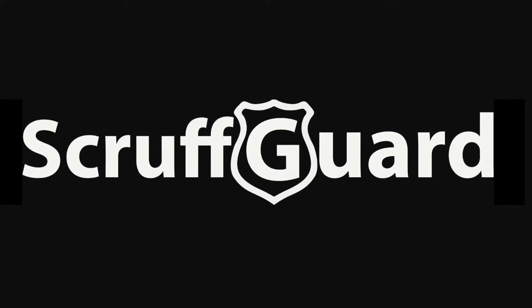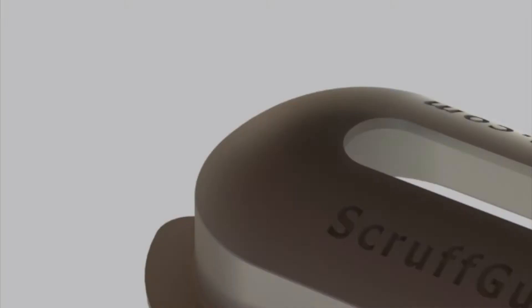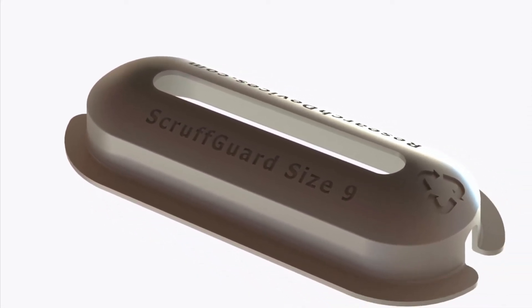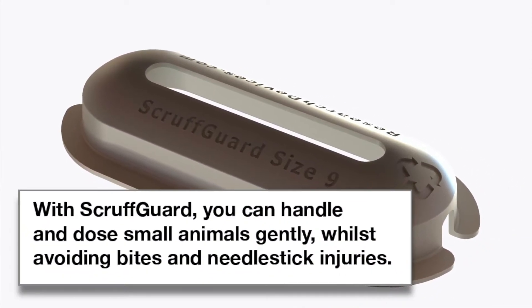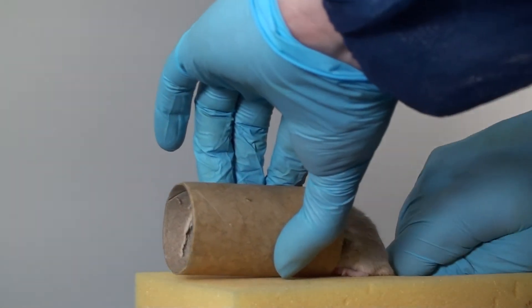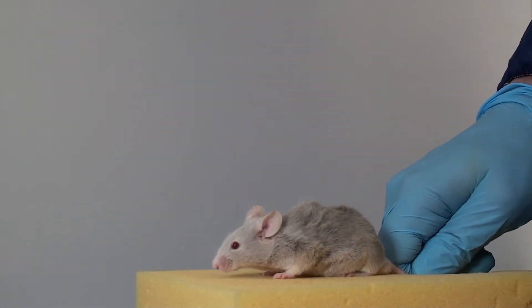DateSand would like to introduce you to the ScruffGuard. ScruffGuard is a tool designed and developed to make dosing procedures less stressful for rodents in veterinary practices or in research laboratories. ScruffGuard is different from traditional manual restraints and is very simple to use.